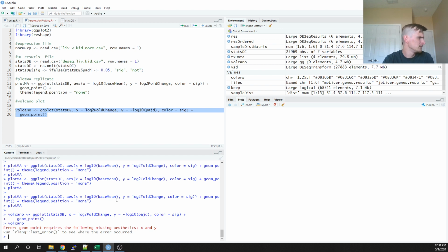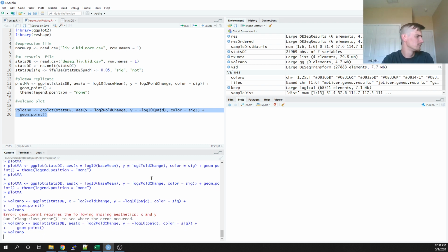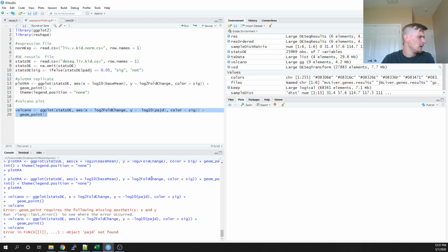Why? Following aesthetics x and y, I did something stupid, because I did not say aes. Make sure my parentheses are in the right place. And here we go. padj. padj.